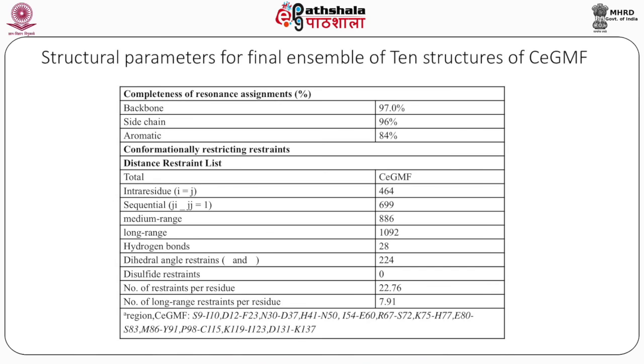Next. The NMR structure is an ensemble of structure solutions that come from the structure calculating program. There is not a single unique structure that would describe the NMR solution structure of a protein. So, the NMR structure carries with it inherently the information about the disordered regions, the less ordered regions, the dynamic regions and also correspondingly the rigid regions in the remaining scaffold of the protein.